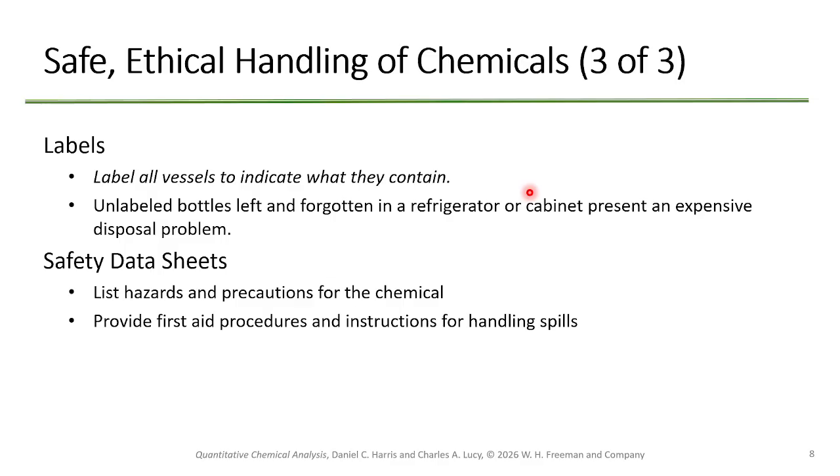First off, how do you do a label? If it's glass, let's say the container's glass. Okay, so tape and a Sharpie works okay as long as you can tape all the way around so it can secure itself. You can actually just straight up do Sharpie on the glass if you want because you can see it on the glass as long as the liquid within it is not going to be dark colored. Okay. Make sure your glass has any previous labeling rubbed off. Anybody know how to rub labeling off if it's written directly on the glass? Alcohol. Yeah. You can use acetone too.